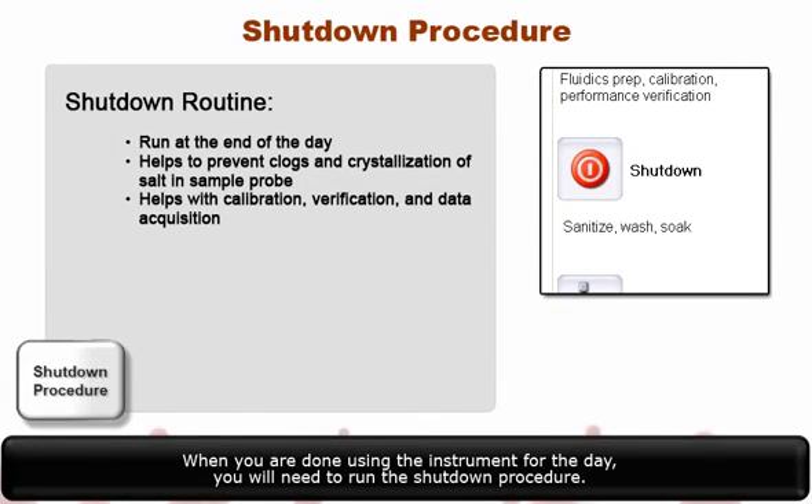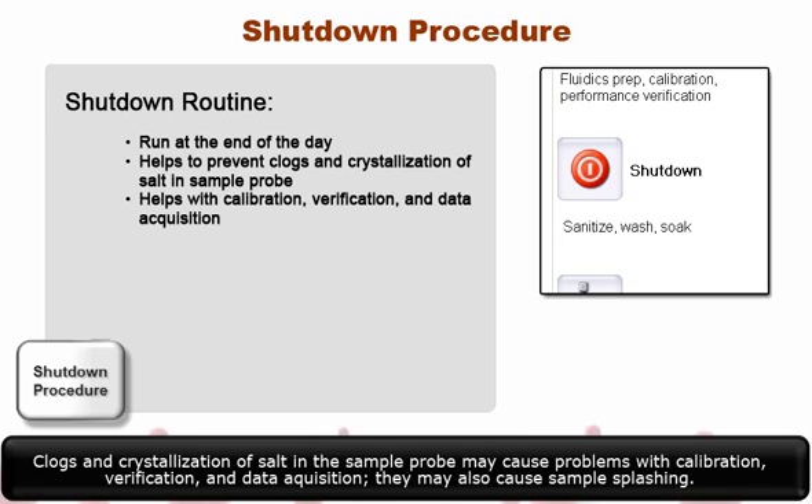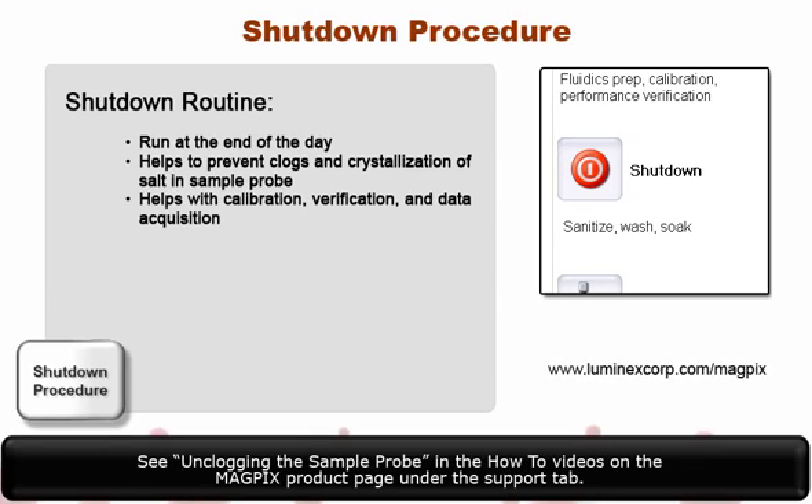When you are done using the instrument for the day, you will need to run the shutdown procedure. Run the daily shutdown routine to prevent clogs and crystallization of salt in the sample probe. Clogs and crystallization of salt in the sample probe may cause problems with calibration, verification, and data acquisition. They may also cause sample splashing. See Unclogging the sample probe in the How-To videos on the MagPix product page under the Support tab.